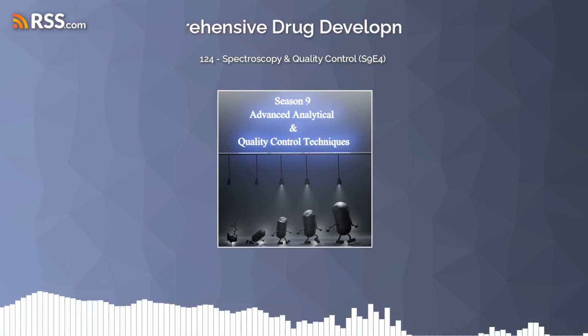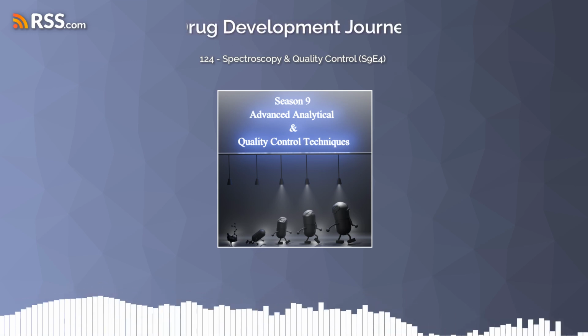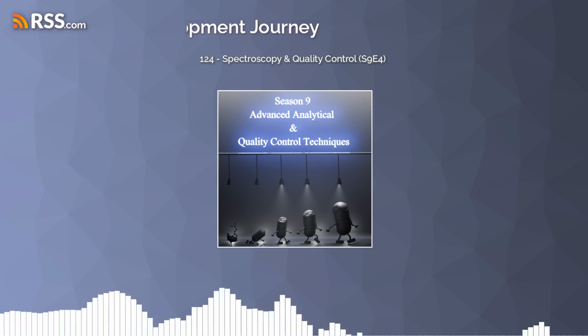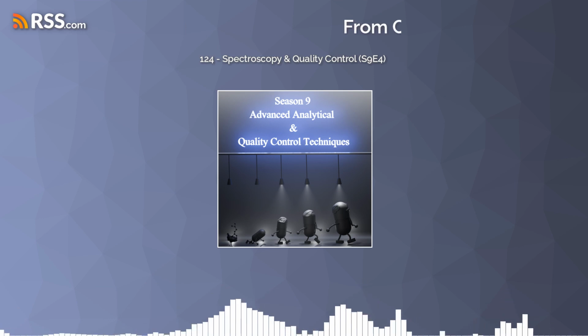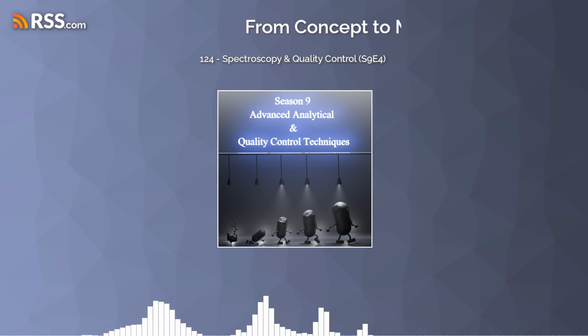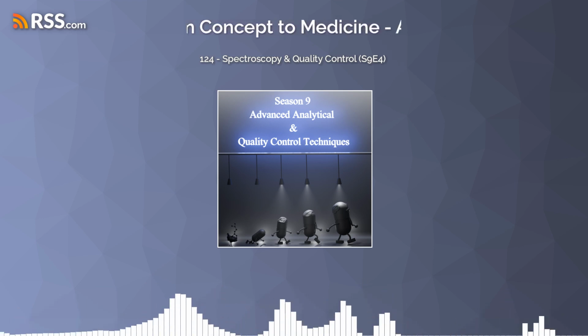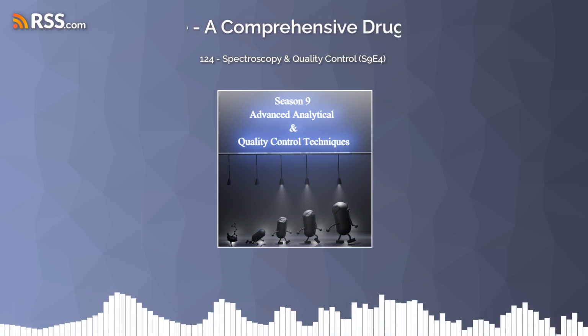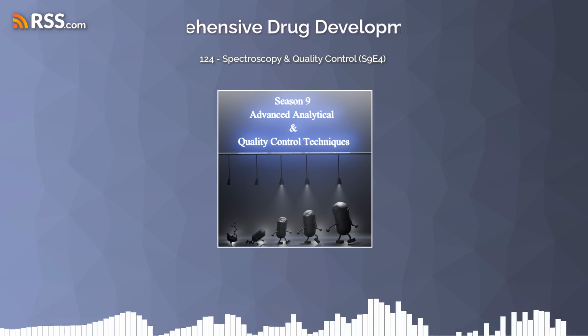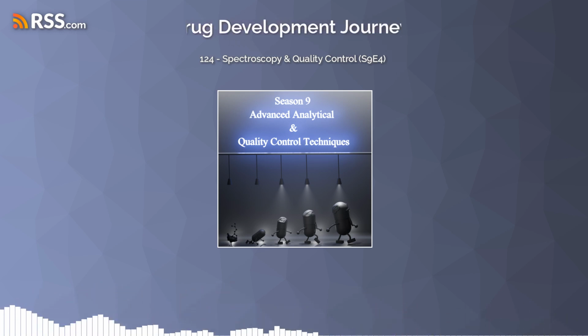Exactly. Okay, now, to really bring this to life, do we have any case studies? We can infer some potential case studies based on the information we've read. Okay, so let's imagine a scenario. Let's say a pharmaceutical company receives a batch of an active pharmaceutical ingredient, and they use IR spectroscopy to analyze it.